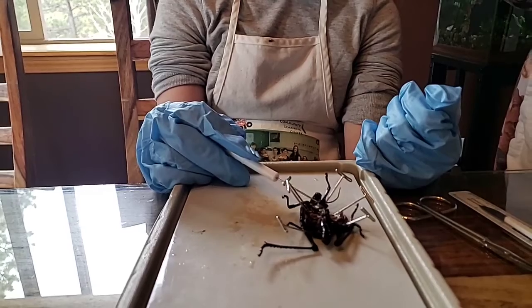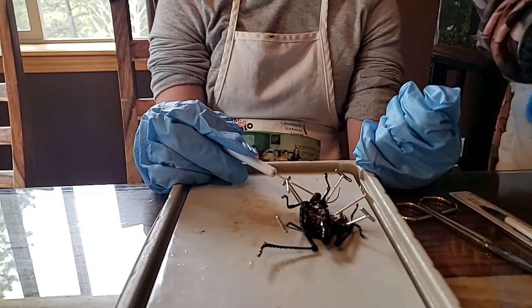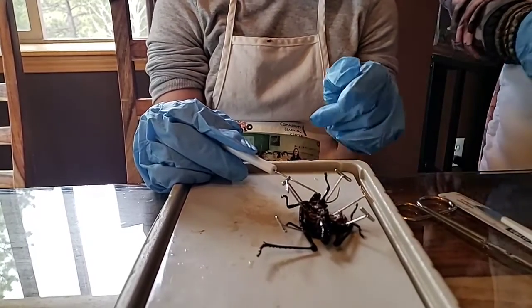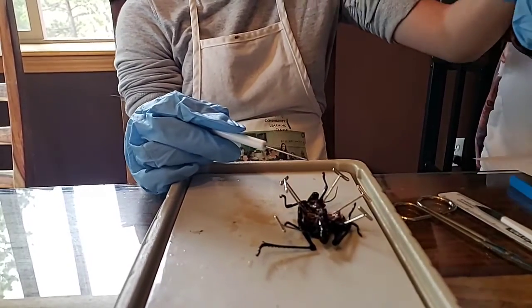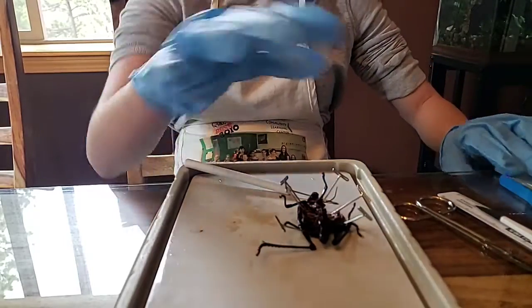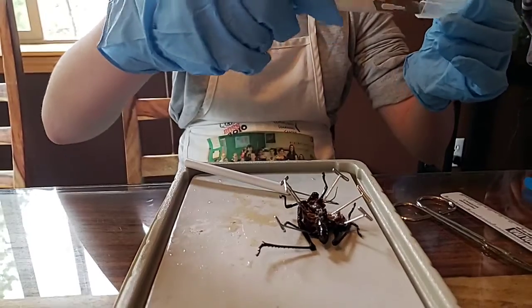So on this one, this big round thing is the crop. Lanston, can you open your page so that you can show Sister where the internal organs are? Judson wants to know if the grasshopper died of COVID. No, it did not. Otherwise, we would not be dissecting it.